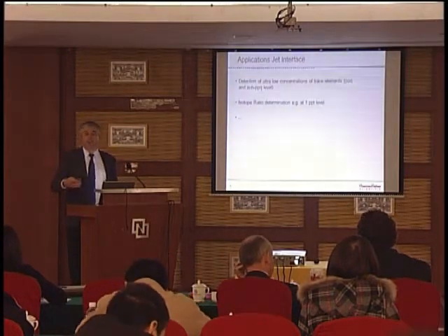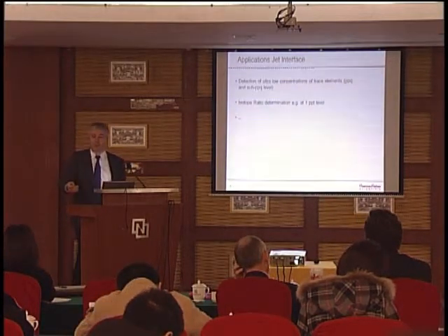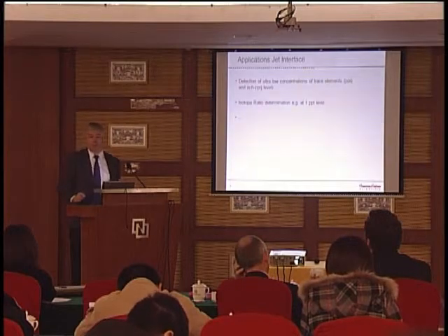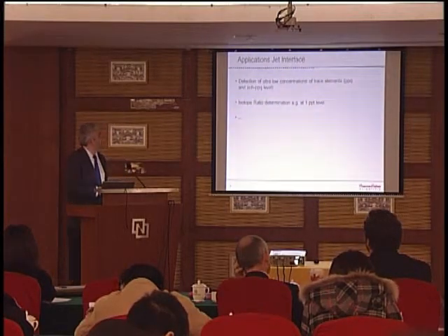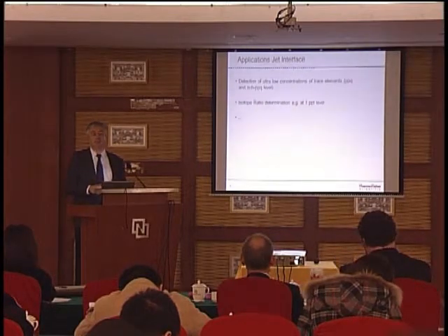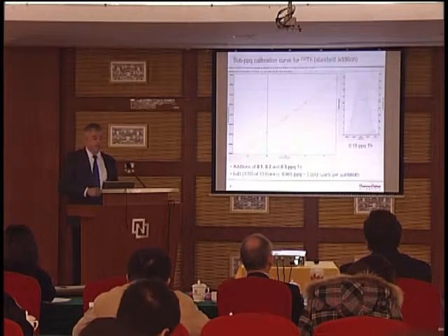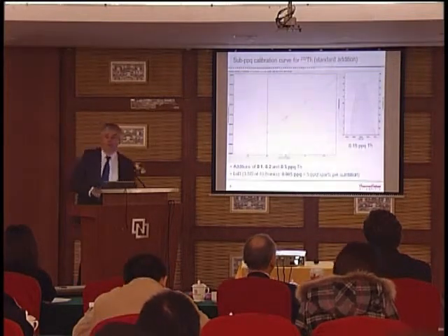So it's even in the sub-ppq, I learned today, so in the ppq or ppt level. So it's even further down. And showing some isotope ratio measurements done at 1 ppt concentration level. So first example, very low detection limits.